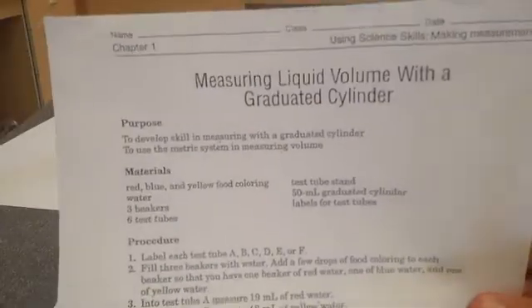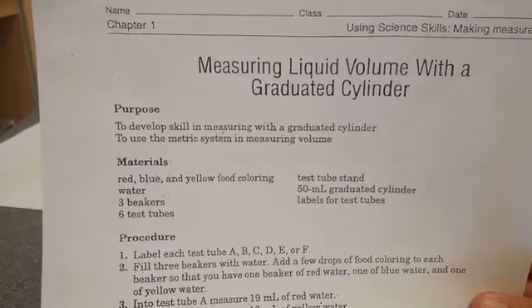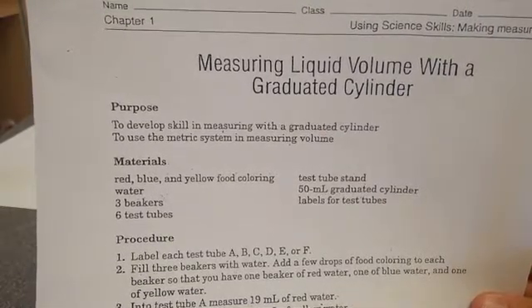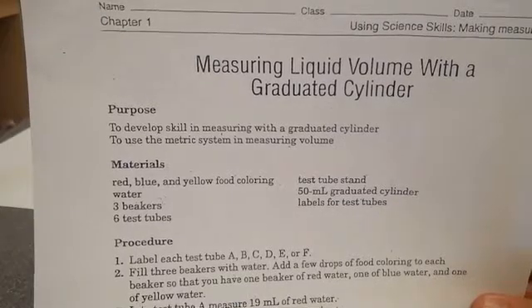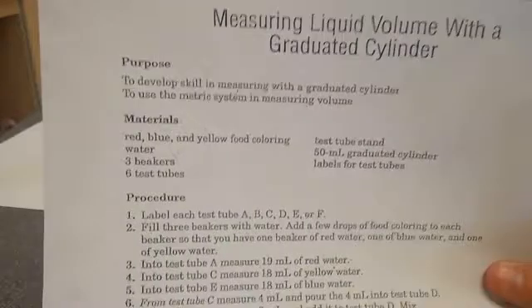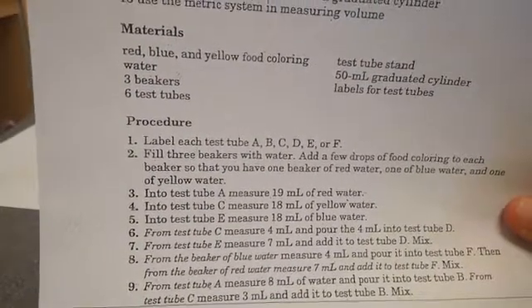Today our purpose is, as you can see here, to develop a skill in measuring with a graduated cylinder and to use the metric system in measuring our volumes. We have a list of materials. All of these items are currently located behind this paper, and a set of procedural steps. Step number 1 was to label each of the test tubes.